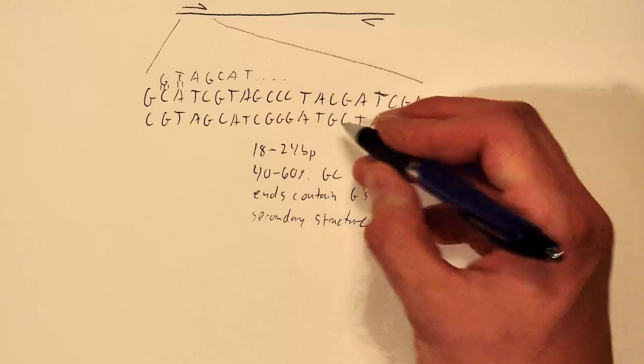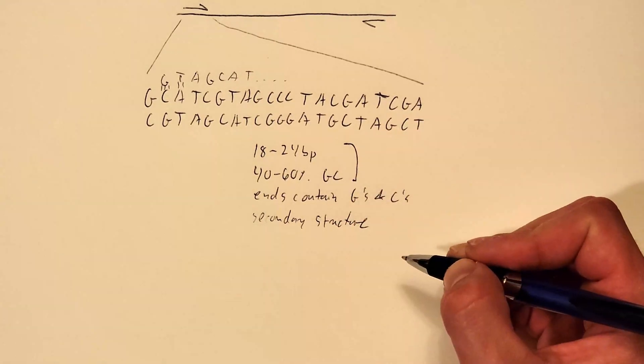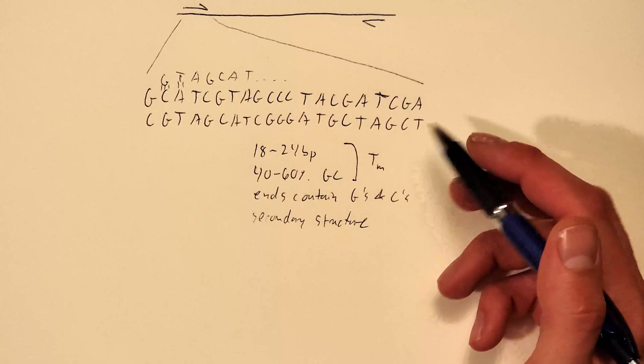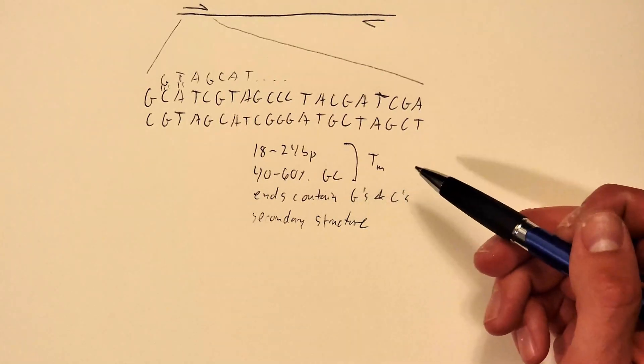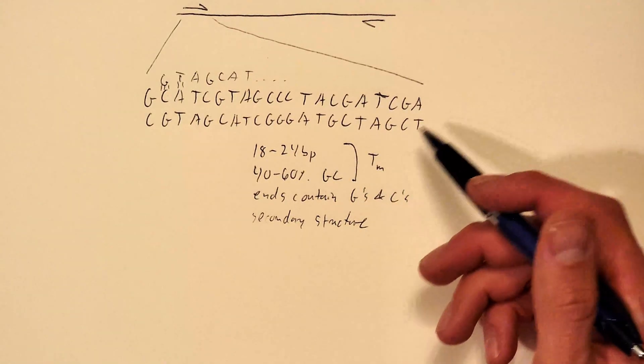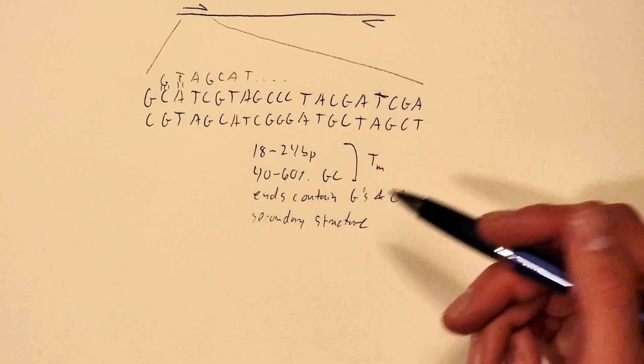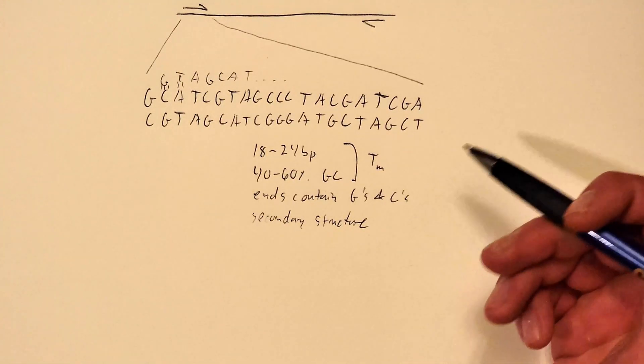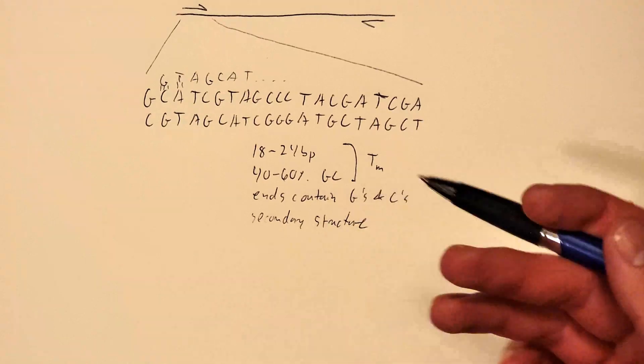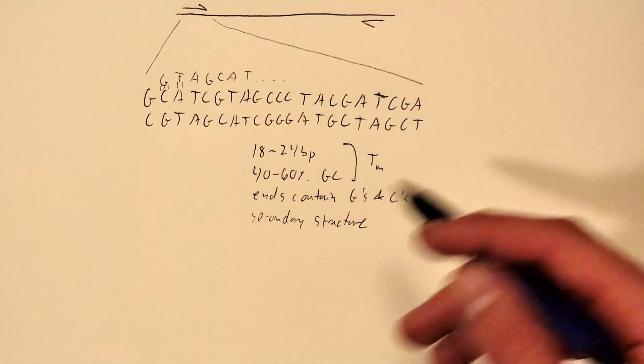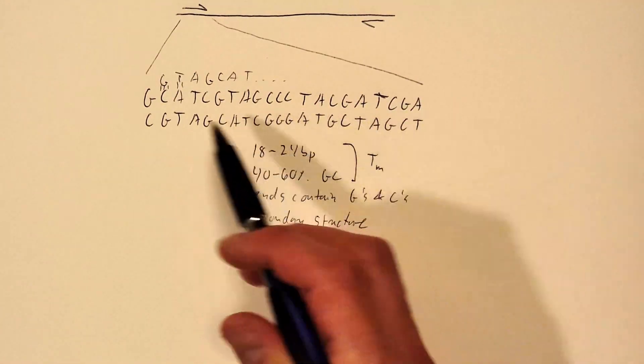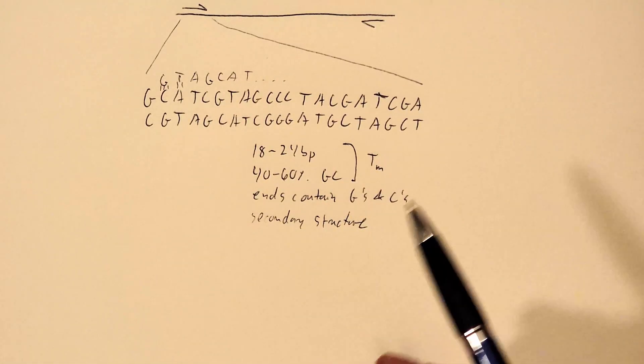Finally the thing to consider and that will be based off of your primer length as well as the GC content is the melting temperature which we denote as the TM. So the TM is based on the GC content and the length of the primer however now we have a bunch of different companies making different polymerases and it's probably best just to take your primer and put it into the company's website, select your polymerase and it will tell you the melting temperature of your primer and not just your one primer but specifically what melting temperature you should use for your primer pair in your final PCR that you run.